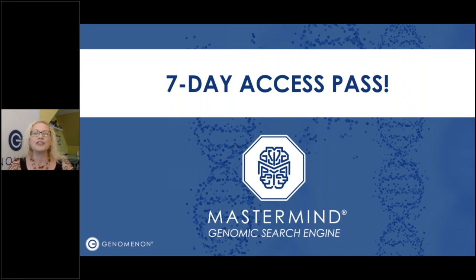It's our goal to make Mastermind the first resource you use when interpreting variants. And I hope that this deep dive masterclass will help you get the most out of it.